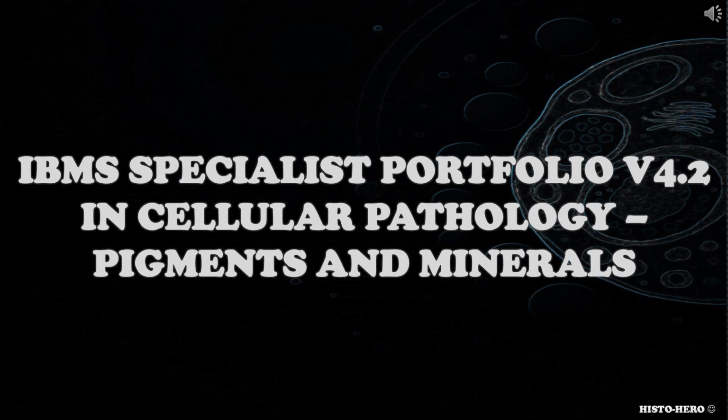And today's video will be about pigments and minerals, which is part of the IBMS specialist portfolio in cellular pathology.